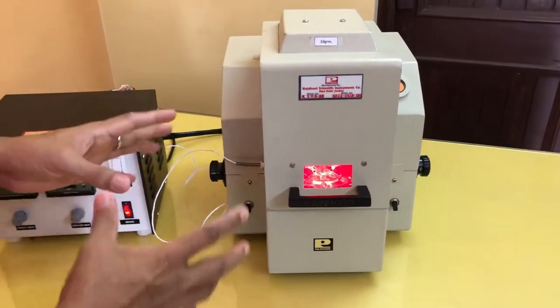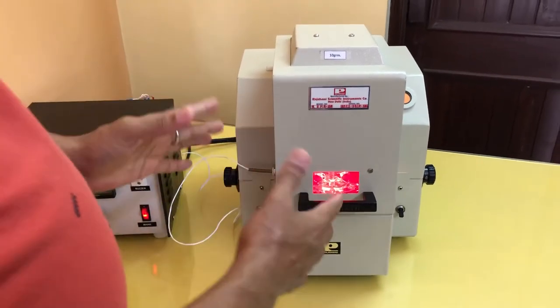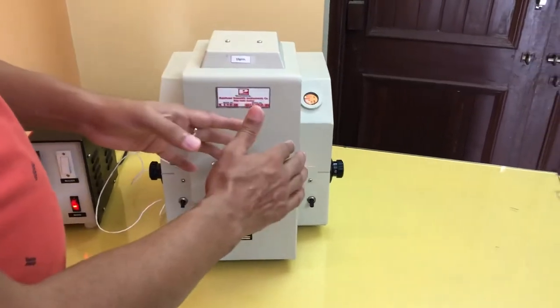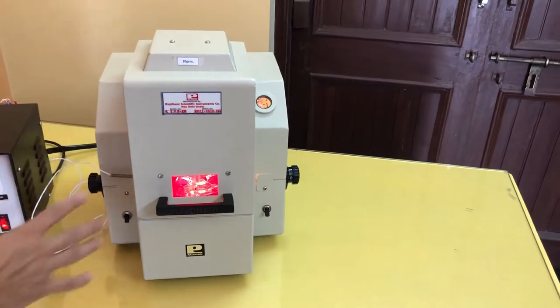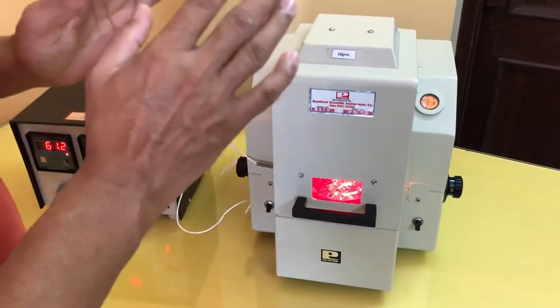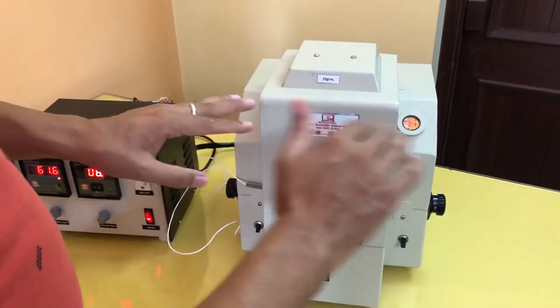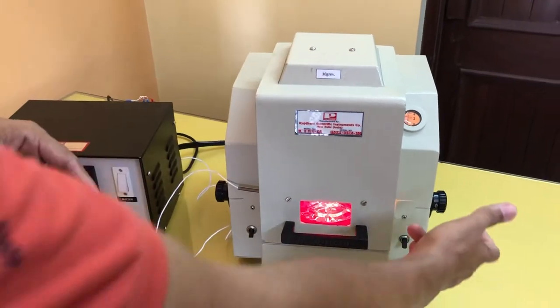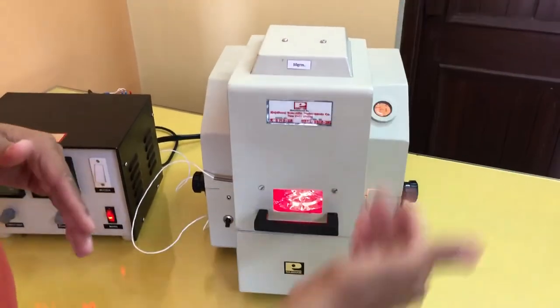Initially there is one doubt for the customer — how would I ensure that total moisture has been vaporized or not? To ensure that, once you have done the fifth step and the pointer is again coinciding with the reference mark with some reading on the scale — suppose 10, 12, or 15 — you keep the instrument on again. Raise the temperature up to 110 degrees and keep it there for at least 2 to 3 minutes. If there is any moisture left in the sample, the pointer will again go up. If the pointer remains stable and coinciding with the reference mark, it means there is no moisture at all. If it has again gone up, then again by rotating this knob, you bring that pointer to the reference mark and read the correct reading on the scale — that is the percentage of moisture.